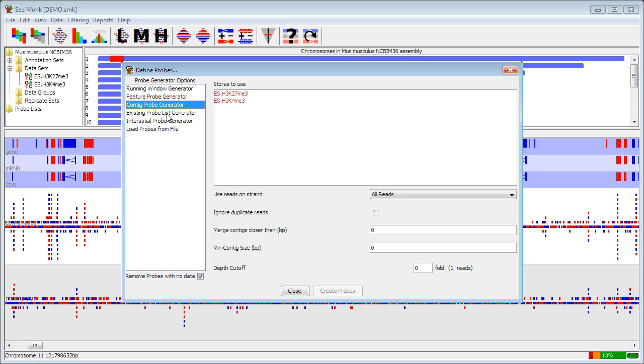There are a couple of more specialized ones. Existing probe list generator is used when you've made a filtered list and you want to turn that into a complete probe set. Interstitial probe generator also operates when you have a set of probes already, and it just puts a new set in between all the set that you had previously.